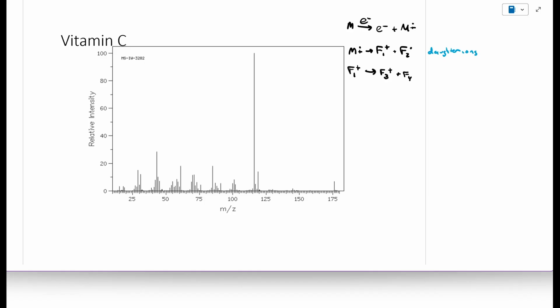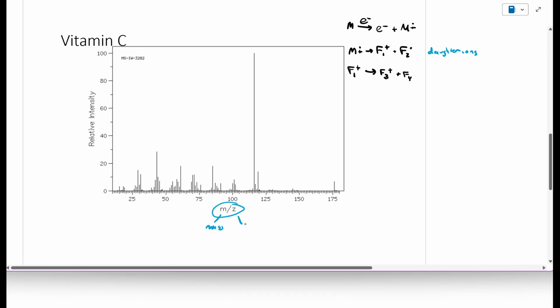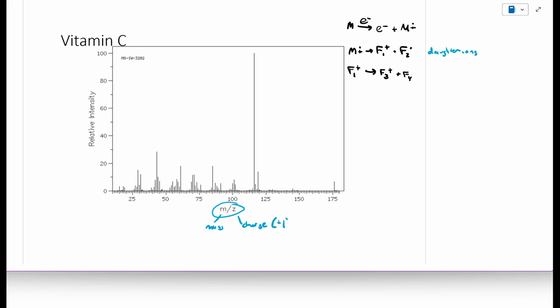All right, so what are we looking at in this mass spec readout? The x-axis is the molecular mass of the molecule. That's technically not true. It's technically, if you look down here at the bottom, m over z. So m is the mass and z is the charge. So it's technically an m to z ratio, a mass to charge ratio. But for our course, the charge will always be +1. We're always going to be detecting +1 cations. So it's mass divided by 1. So we can essentially say that this is the molecular weight on the x-axis. That's a fine way of thinking about it.